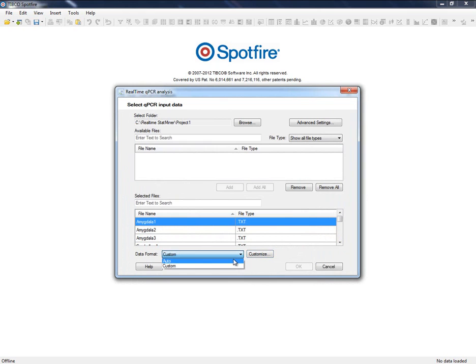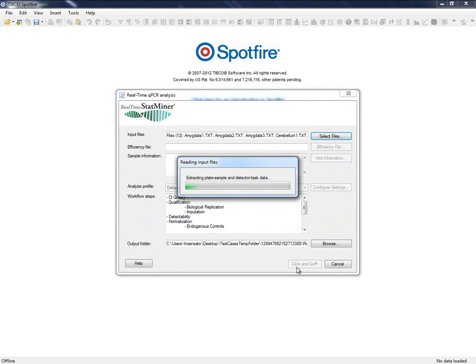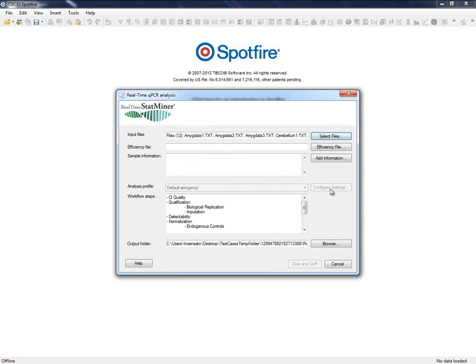OK, so let's load our data. In this example, we do not need to provide any efficiency information, so next step is to define the experimental design of the analysis.